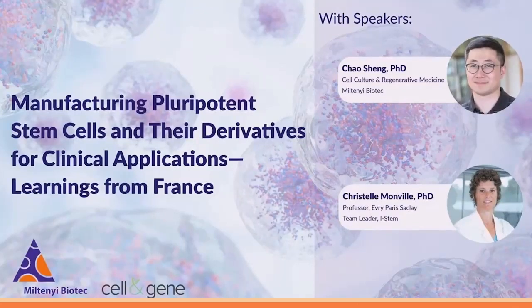So today, I will first very quickly introduce the established workflows at Miltenyi Biotec for automated and closed manufacturing of human pluripotent stem cells and their derivatives. And then I will hand over to Professor Christelle Monville, and she will introduce their exciting projects on developing a novel tissue engineered product consisting of RPE cells derived from clinical grade human embryonic stem cells, and their ongoing effort in developing protocols to upscale the production of RPE cells using automated and GMP-compliant solutions, for example, the CliniMACS Prodigy platform.